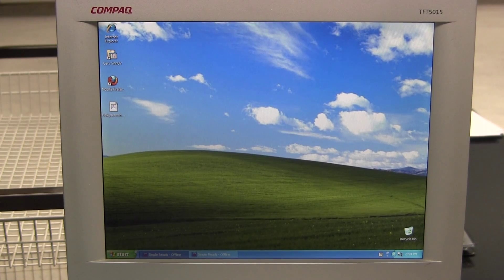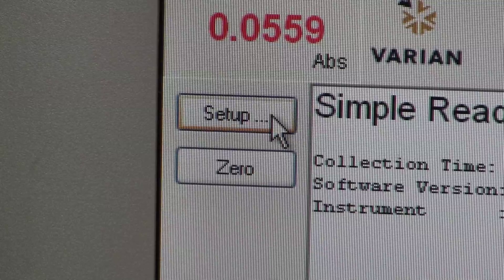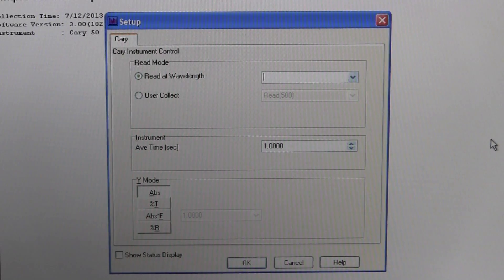Open up the program located under the start menu, called Simple Reads. Press the setup icon in the upper left side of the window, set the wavelength to read the desired absorbance, and press OK.